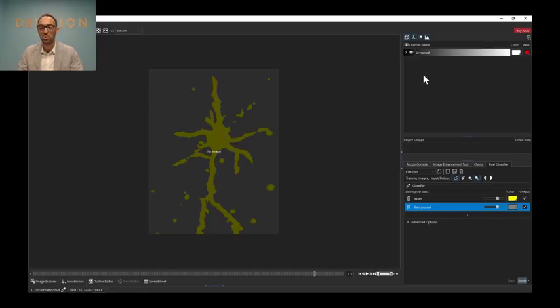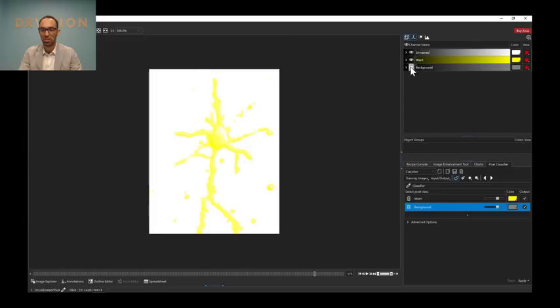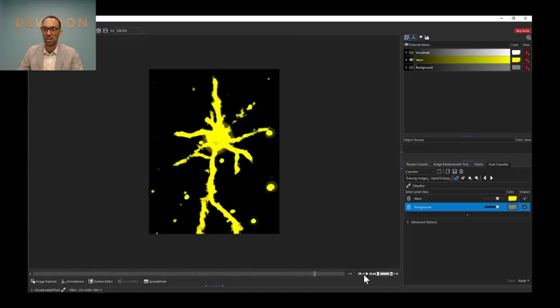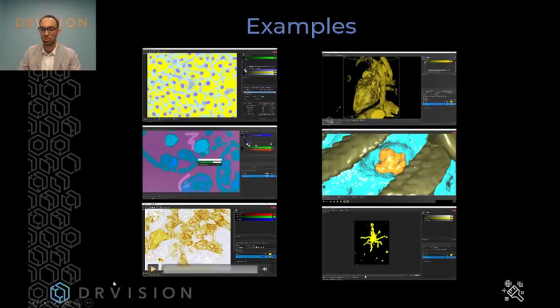Yeah, we will work on making the preview more realistic, but it's a trade-off, as you know. We want to make it fast. The preview needs to be fast, so it's not as accurate as the actual output. So you can expect a little bit better results from the actual output than the preview, which is a nice thing. So there it is. Very high contrast versus the original image that was very low contrast.